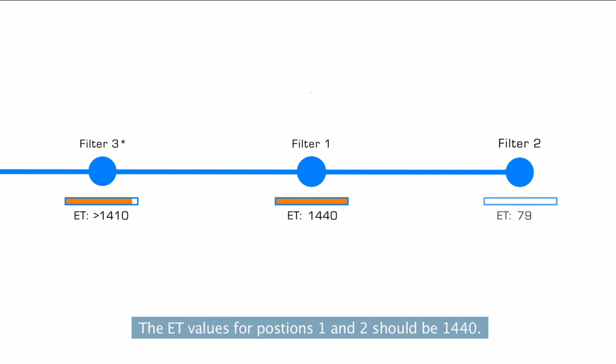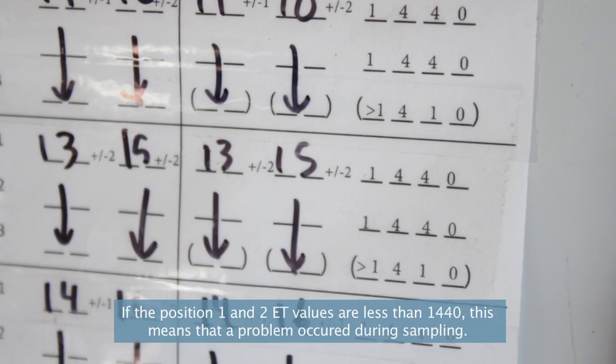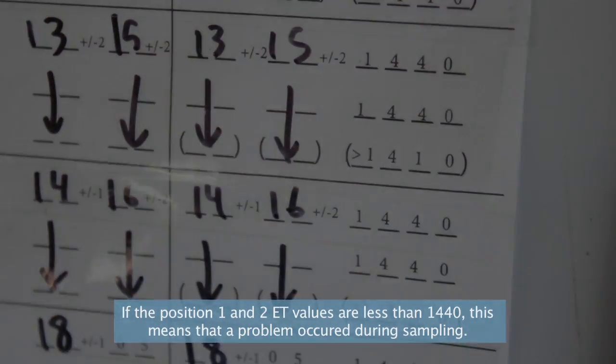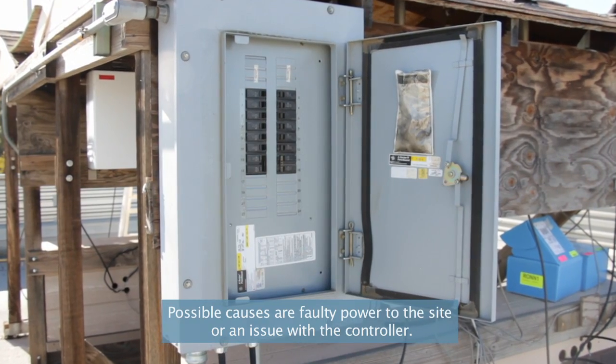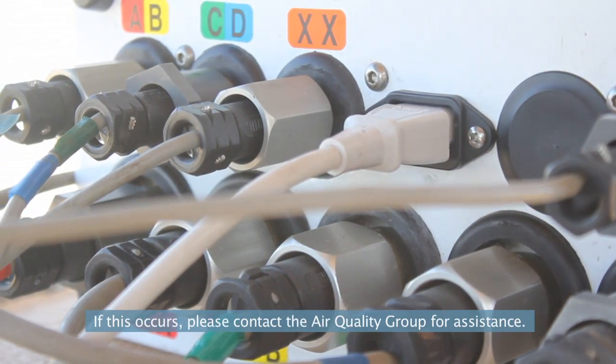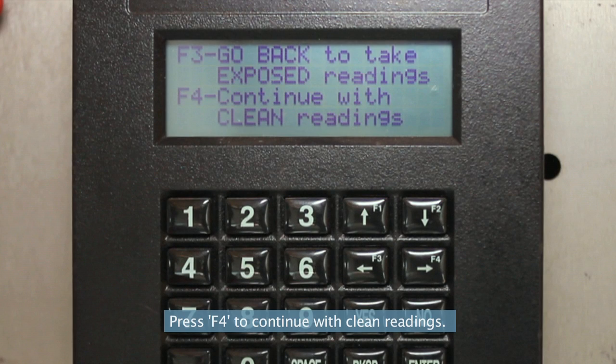ET values for filter position 1 and 2 should be 1440. If the position 1 and 2 ET values are less than 1440, this means that a problem occurred during sampling. Possible causes are faulty power to the site or an issue with the controller. If this occurs, please contact the air quality group for assistance. Press F4 to continue with clean readings. The controller will begin initial readings.